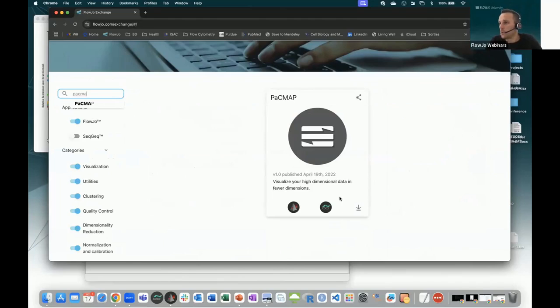What's the difference between the export concatenate button and the downsampling plugin? We updated the export concatenate button, so it's basically the same. With the export concatenate platform, now you can do the downsampling with it. Before, you had to add the downsampling plugin to do it.